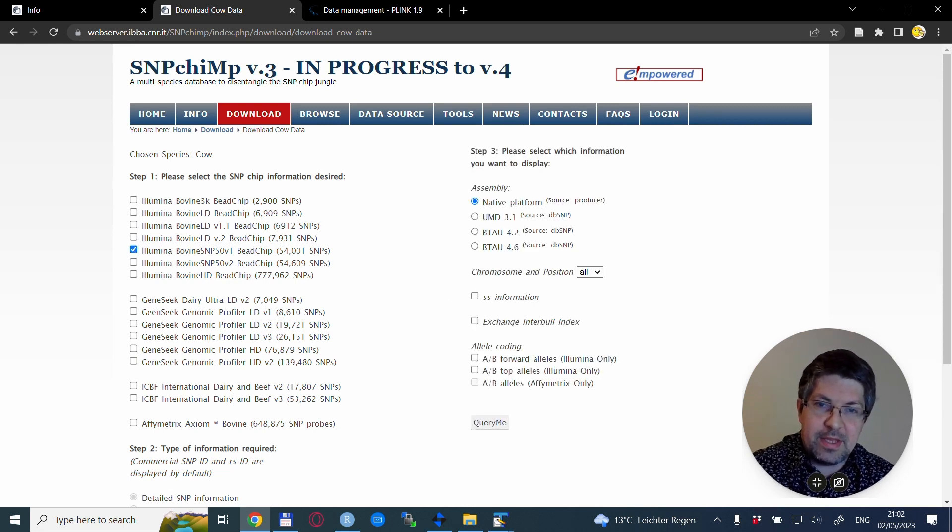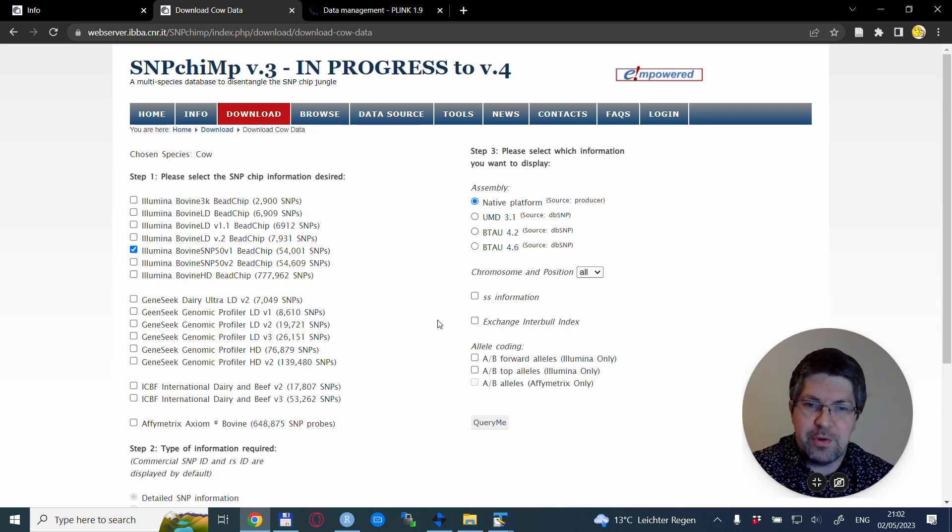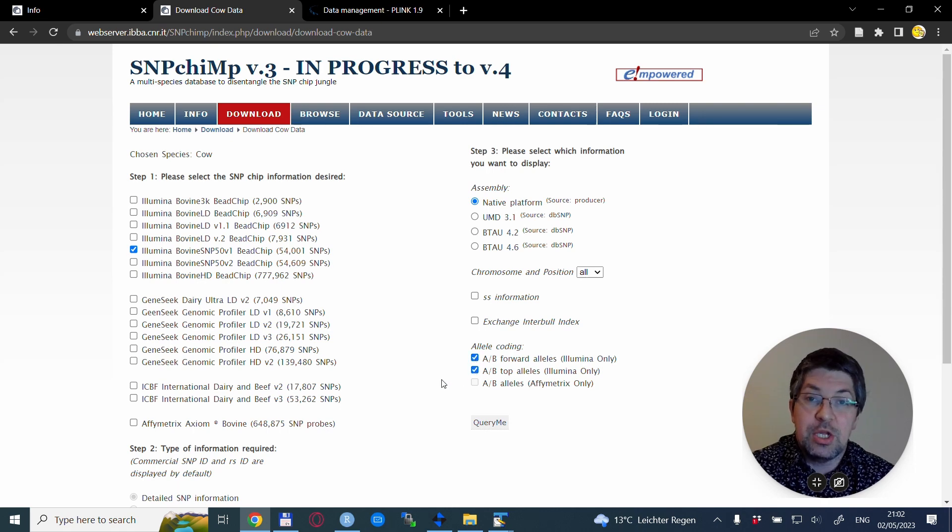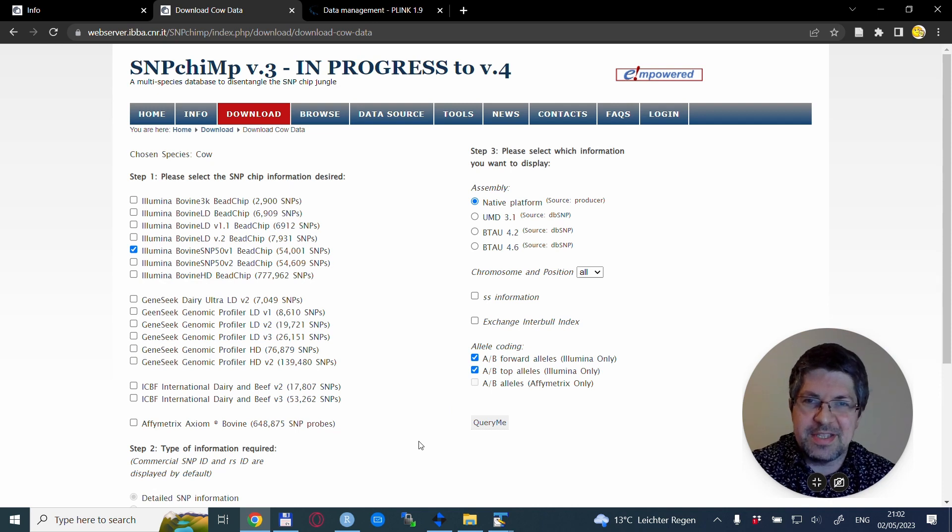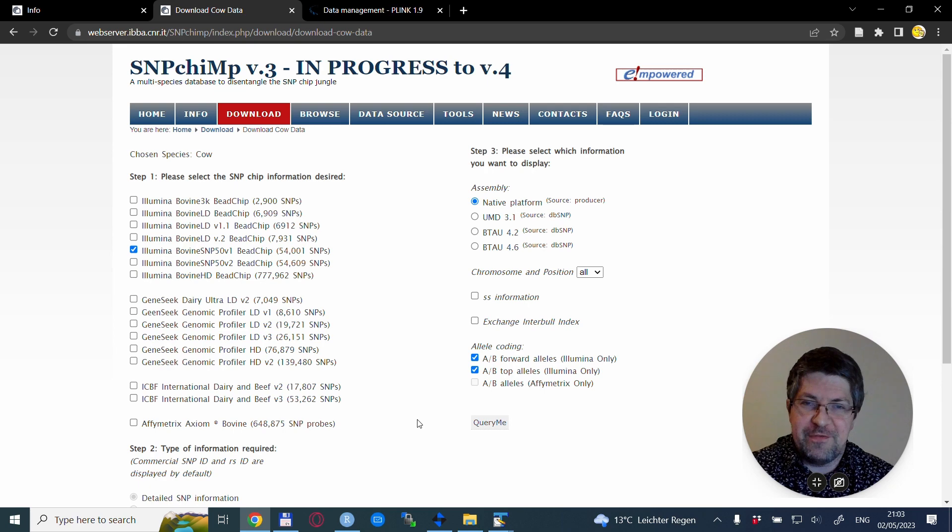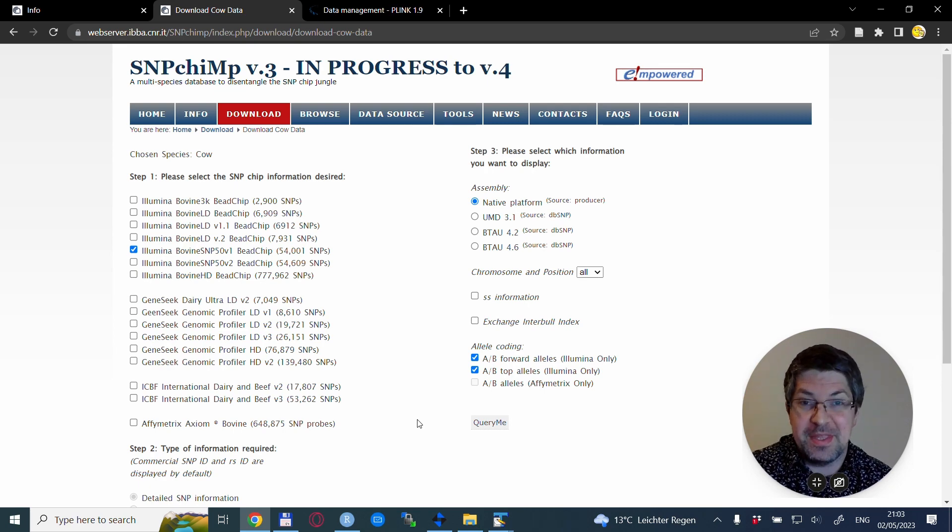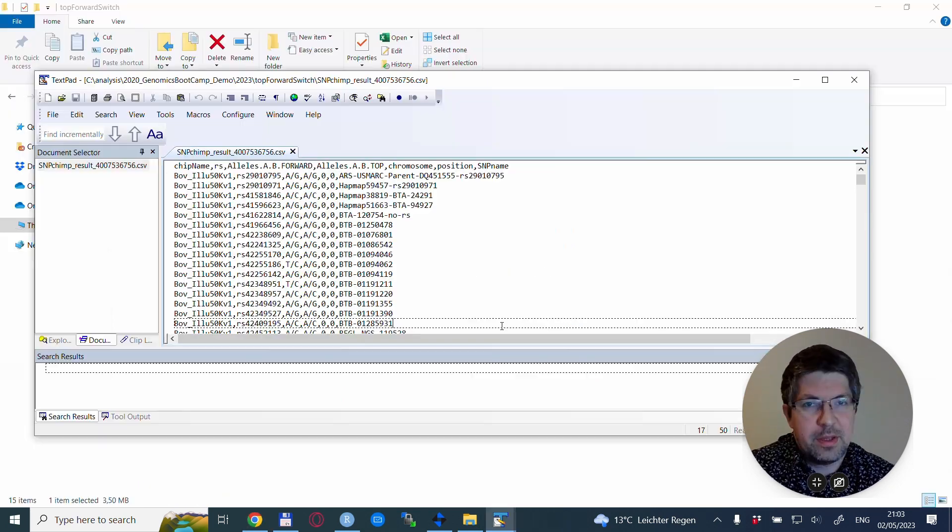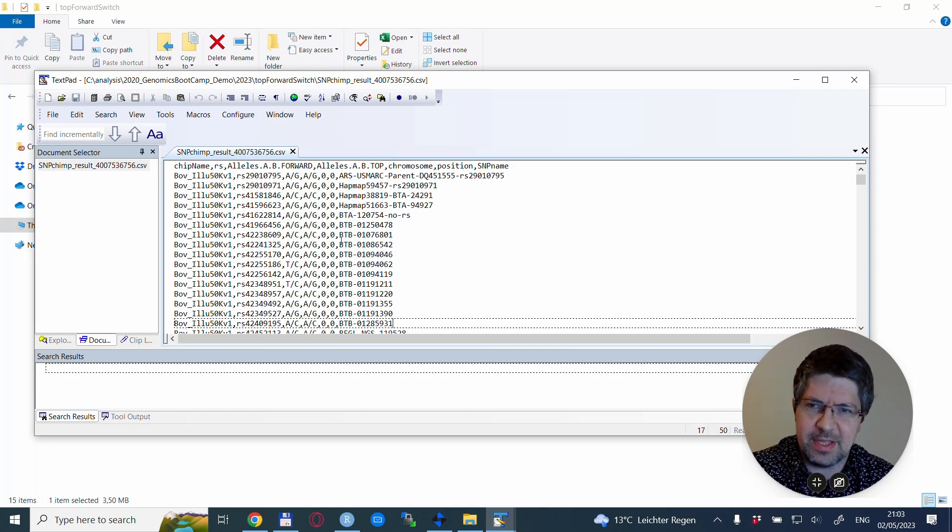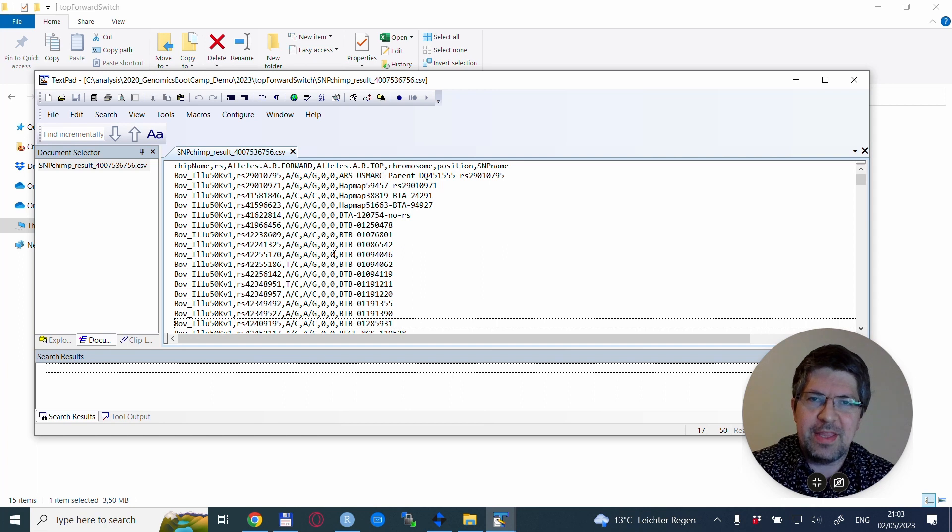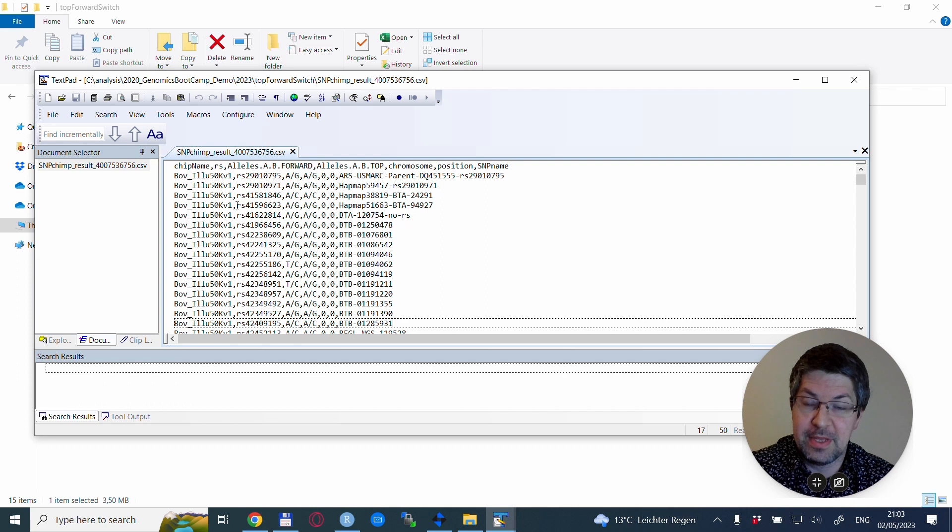I take it in native form, but what is very important is that I click the allele coding AB forward alleles and AB TOP alleles and download this dataset. If you have a different SNP chip or different species, you adapt these steps accordingly.